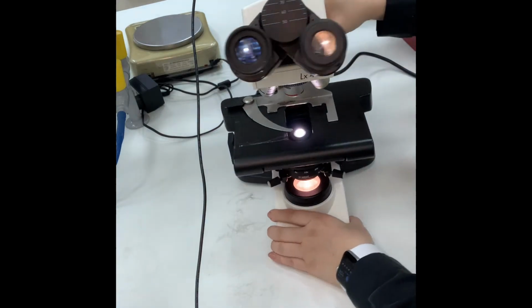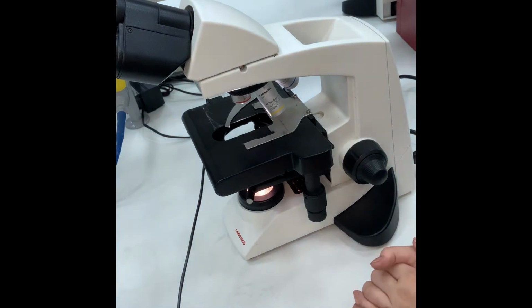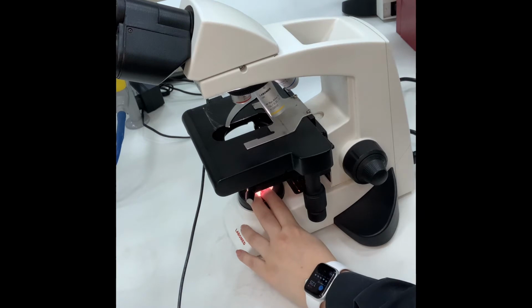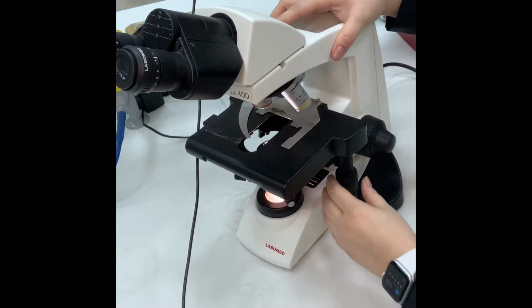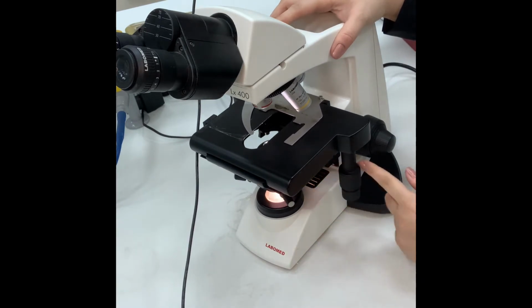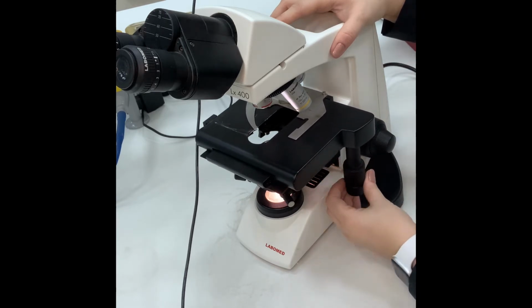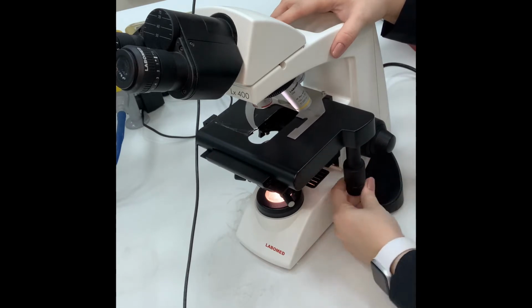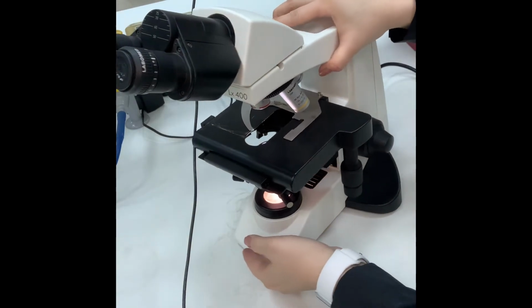So before we know how to use the microscope, I need you to understand the basic building parts of a microscope. This is the base, this is the light source, this is the stage, and I control the movement of the stage by mechanical knobs. In the assignments that I will give you, in the picture, you have A and B. This is just right and left, so both of them you can call mechanical knobs.